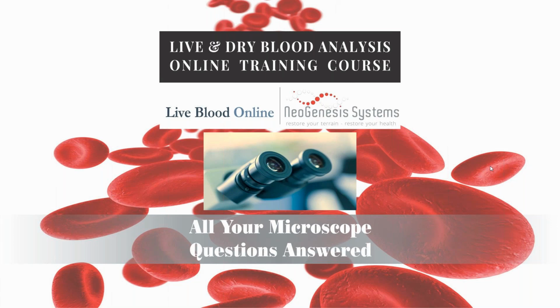Yeah, we will be covering that in quite a lot of detail during the slides that we'll be going through. I have some slides of live blood samples in Darkfield that illustrate what happens to the sample when any of the specifications that we have on our systems is changed. If any of the specifications are changed, you end up with a compromise in terms of what you're able to see in a live blood sample. So it really comes down to the actual specifications of the microscopes, and we have the most important ones listed in descending order of importance, and we'll be looking through those later in the slideshow. Okay, so that issue will be answered throughout, yes, because we do get it a lot.